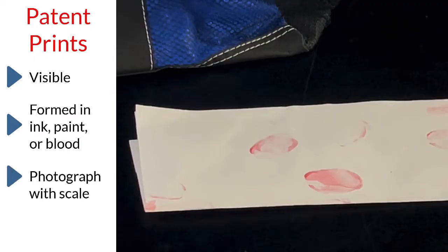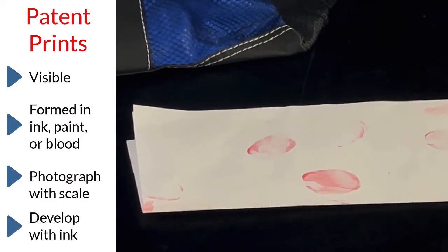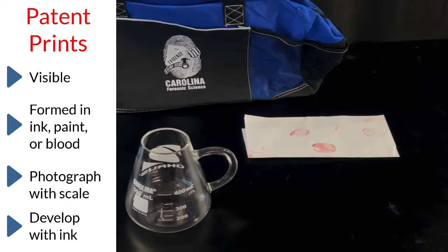To document patent prints, photograph them with a scale. Developing patent prints with ink is a very common technique that will be reviewed later in this video.